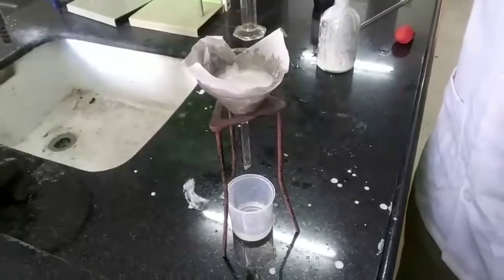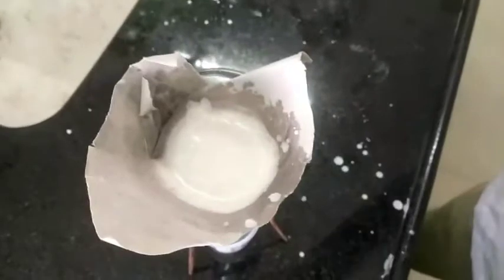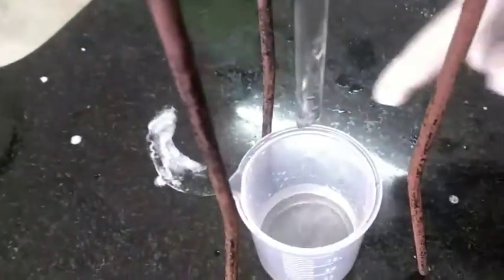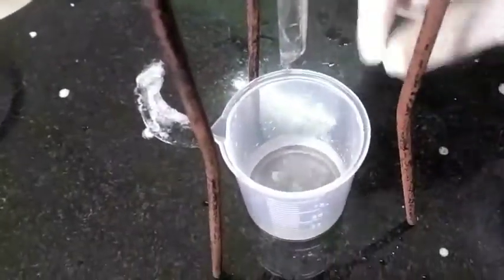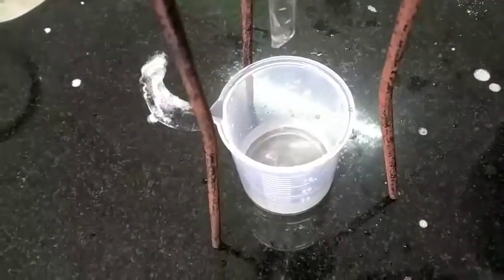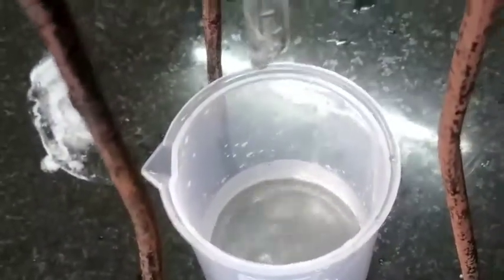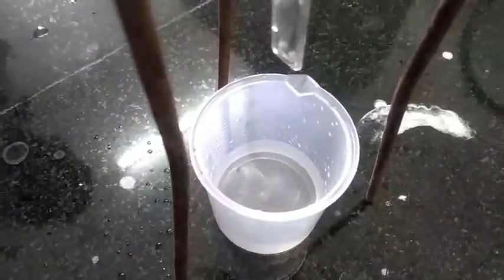Why are we doing this filtration process? Because we have to remove the talc. Now you can see here, all the talc is being removed, and in the bottom you can see all the peppermint water is coming out. This is the peppermint water which we have prepared.